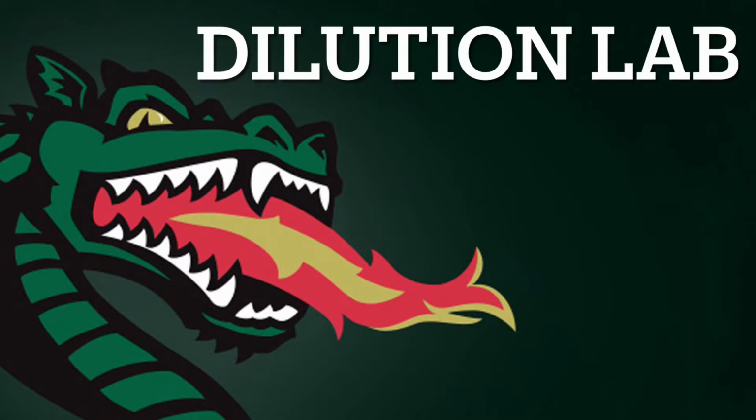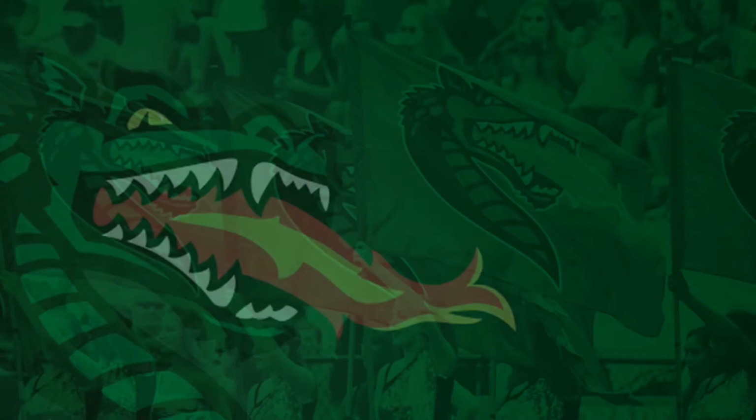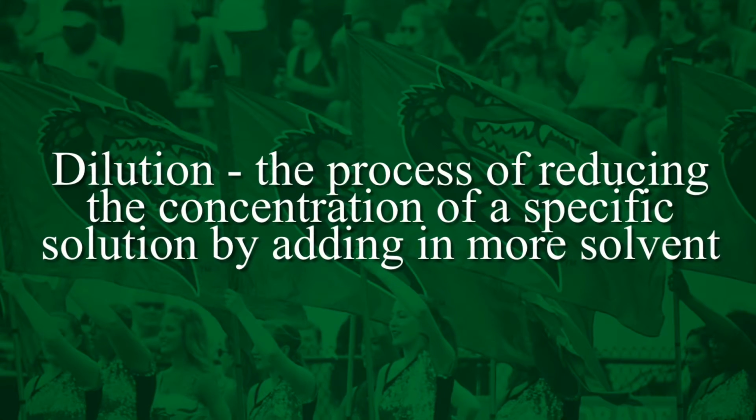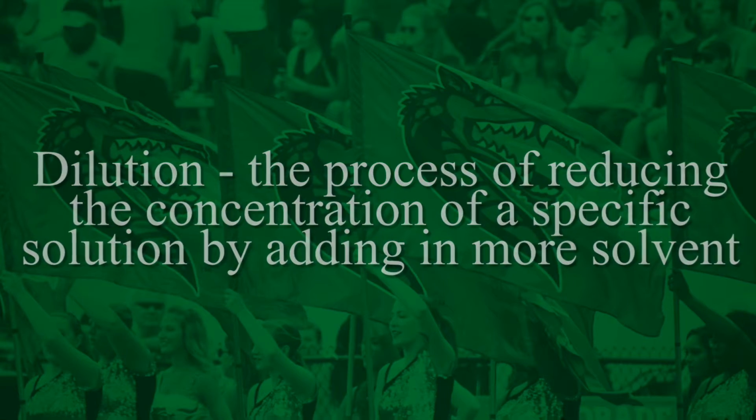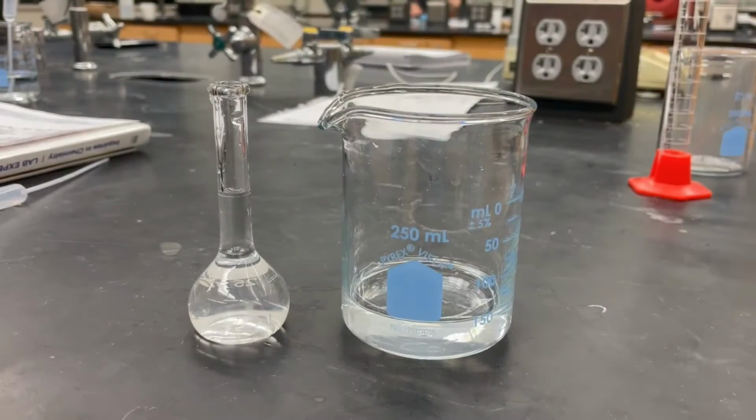Welcome to today's lab video, where we will learn about properly conducting a dilution experiment. A dilution is the process of reducing the concentration of a specific solution by adding in more solvent, which in most cases is water. In this photo, you can see the end results of today's lab.